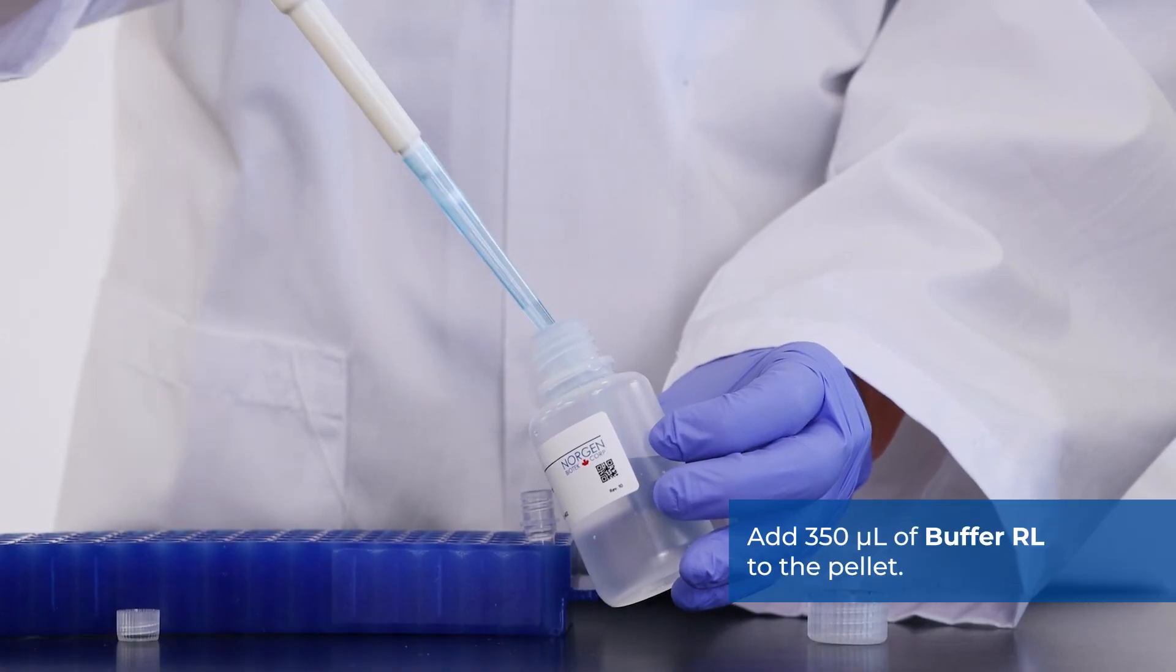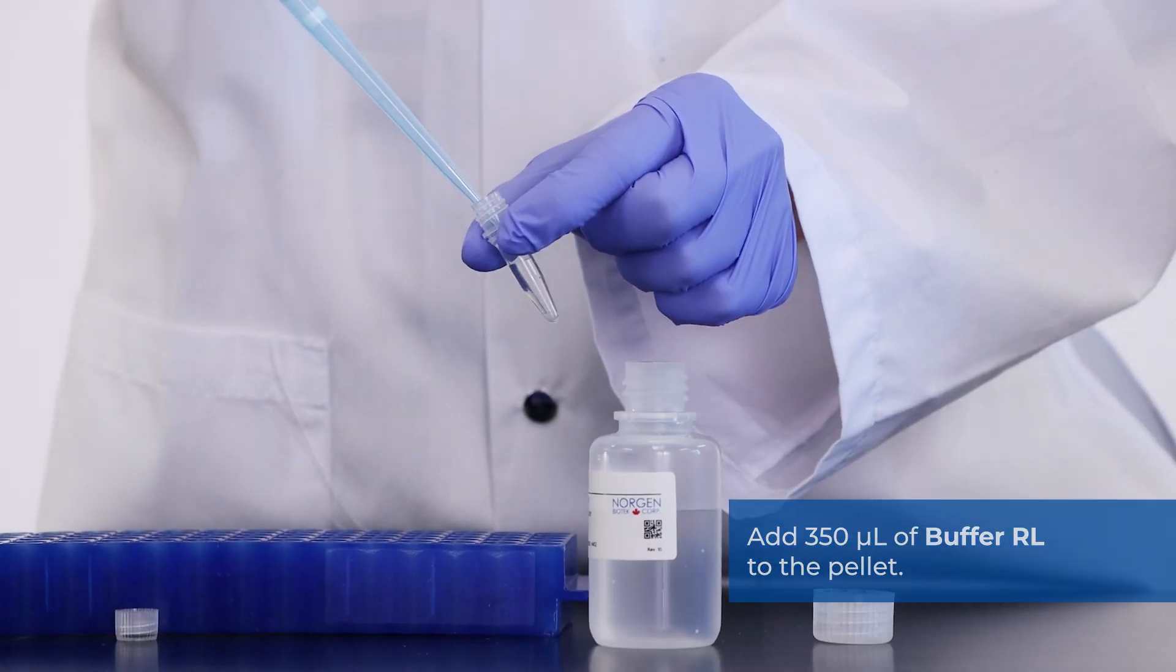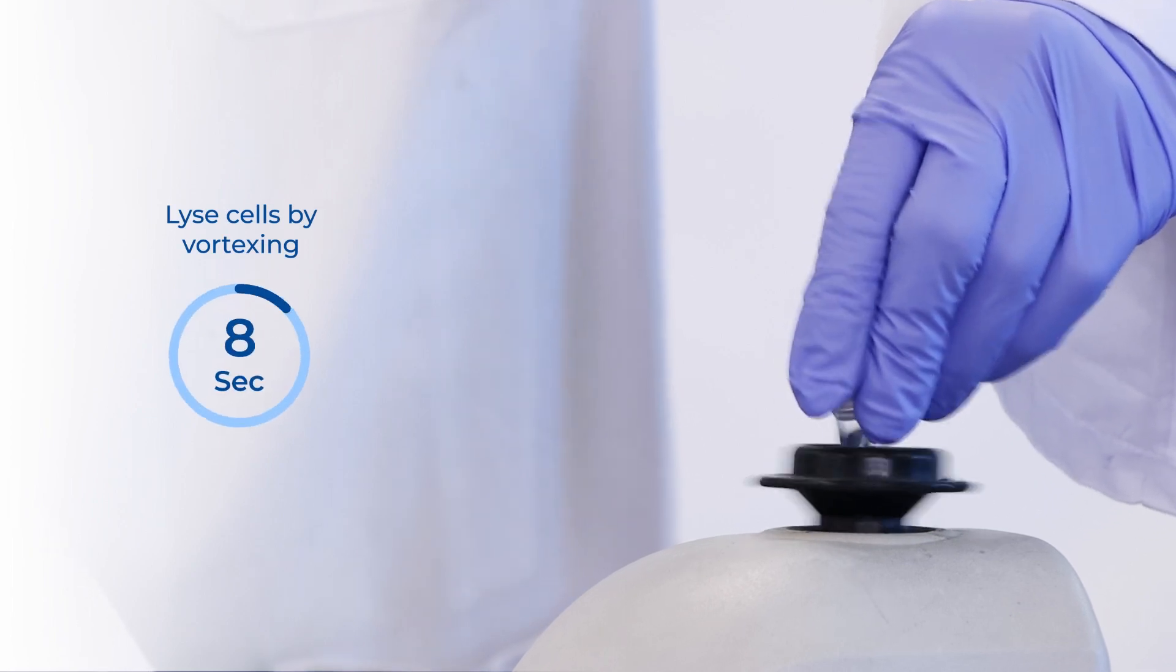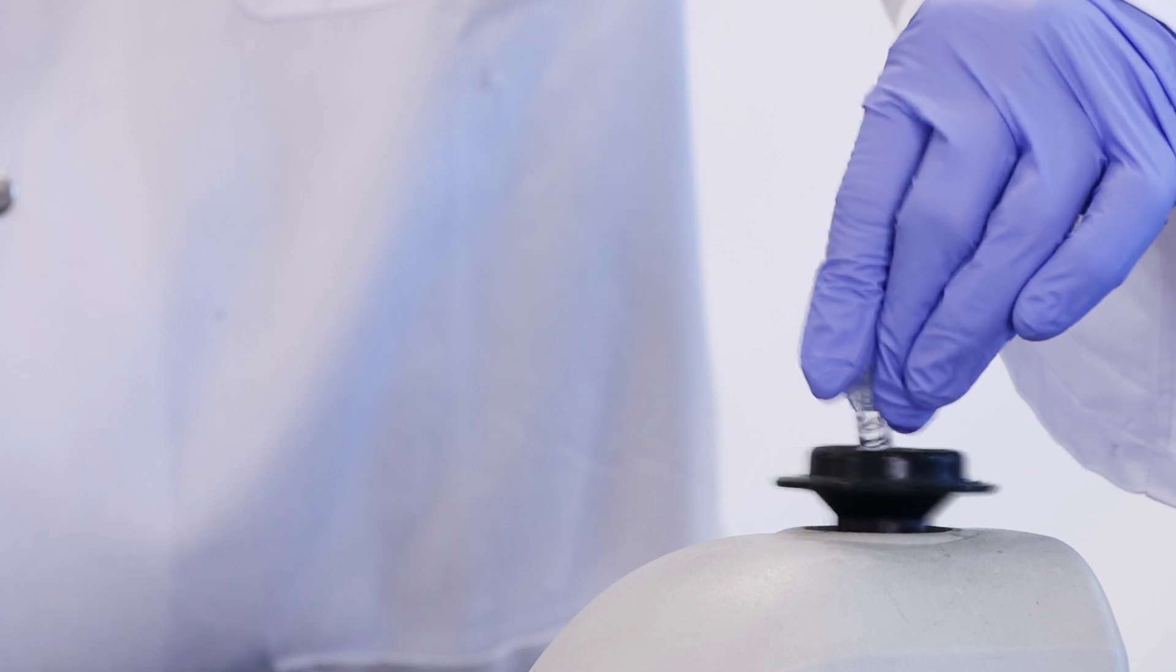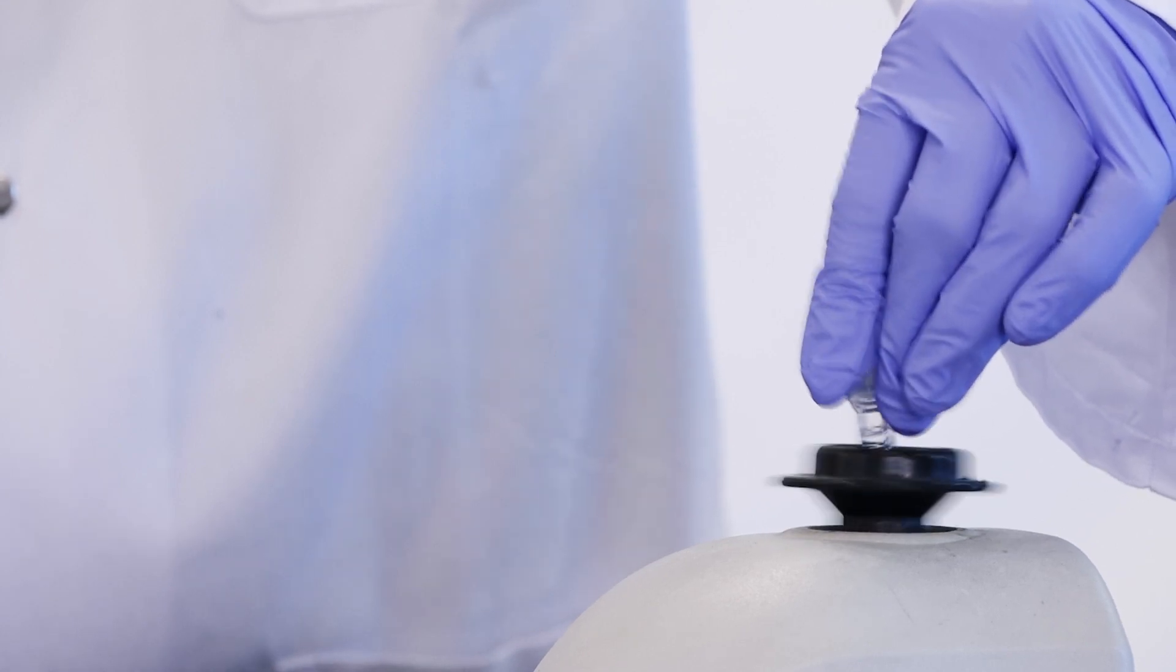Add 350 microliters of buffer RL to the pellet. Lyse cells by vortexing for 15 seconds. Ensure that the entire pellet is completely dissolved before proceeding to the next step.